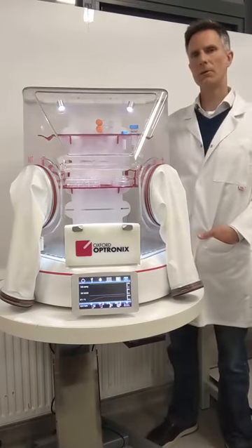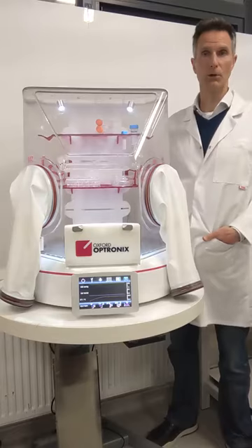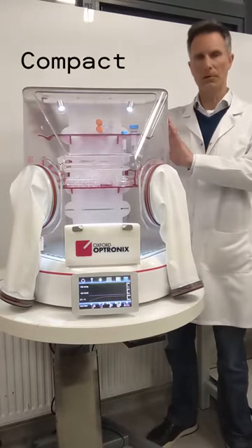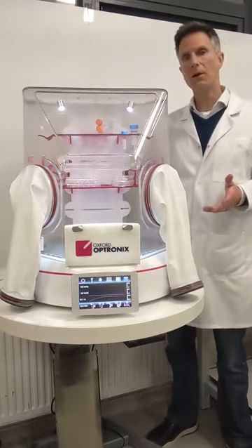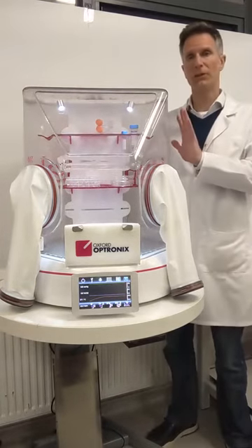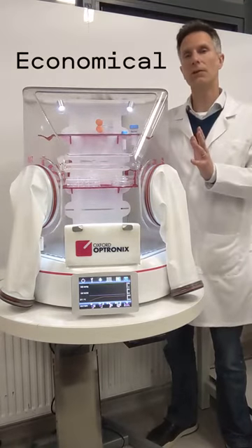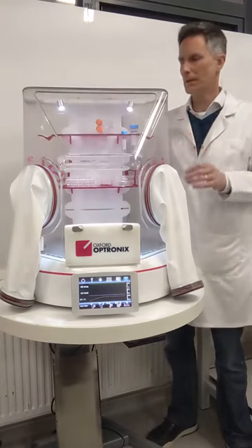What are some of the unique features of the HypoxyLab? Well, first and foremost, and most obviously, its compact physical size. The HypoxyLab is intended to be accommodated on a typical laboratory bench, if so desired. That small physical size also minimizes gas wastage in the maintenance of a controlled oxygen environment within the system.